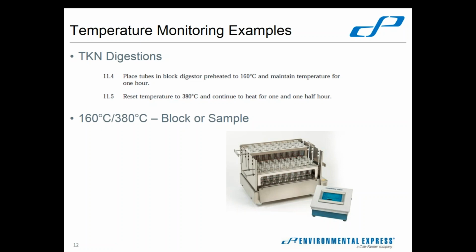And again, it asks for the block to be set to 380 degrees. Now, I've had people call and ask, how are they supposed to verify that the block temperature truly is 380 degrees? There is not a good way to do that. I think I've got some examples later talking about how the temperature of an object cannot exceed its boiling point.